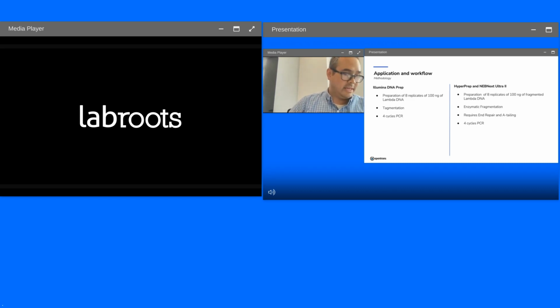For Illumina, the DNA Prep is tagmentation. So this is different from the library prep I mentioned earlier, which used fragmentation. Tagmentation uses Illumina's transposase to both fragment and tag the adapter simultaneously, so that's why they call it tagmentation. They've gone the extra mile to make it extra fancy by making it bead linked. So the transposase is linked to a bead. So not only does it fragment and tag it simultaneously, it will wash away anything that hasn't been tagmented.